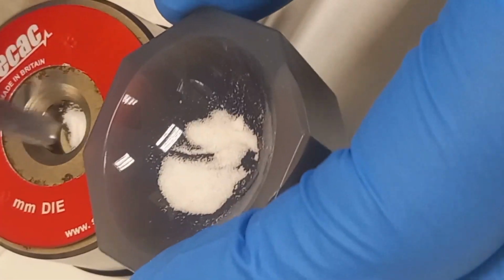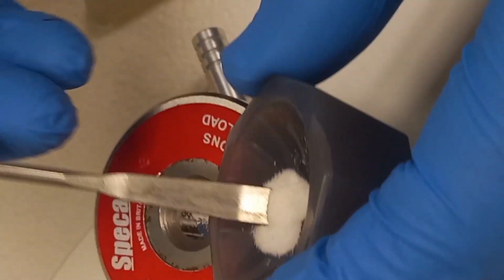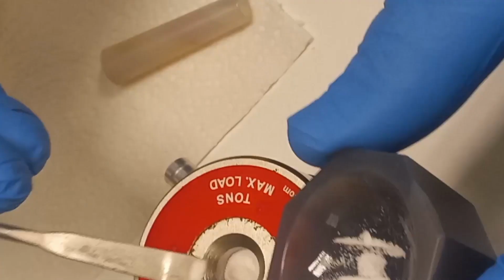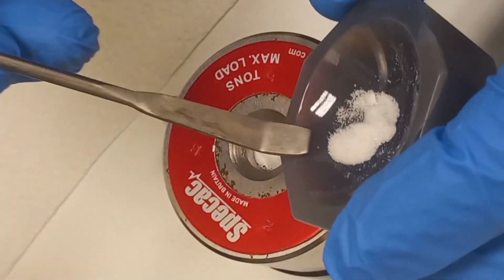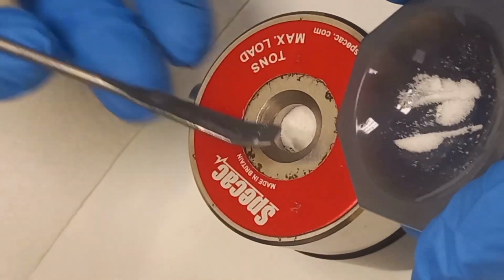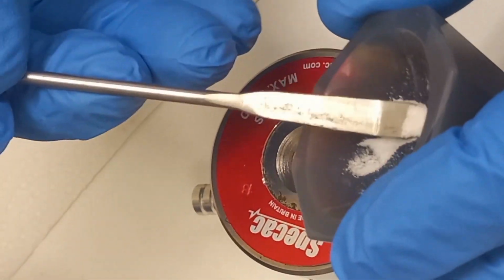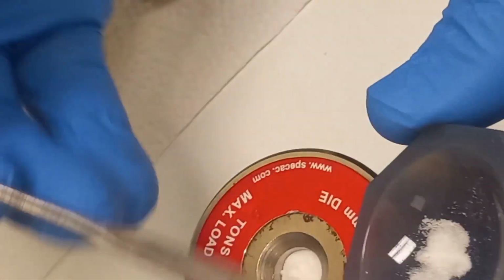Peaks in the spectrum correspond to specific vibrations or functional groups present in the sample. The infrared spectrum is analyzed to identify the functional groups and chemical bonds in a sample. Comparisons with reference spectra or databases can aid in the identification and characterization of the sample.